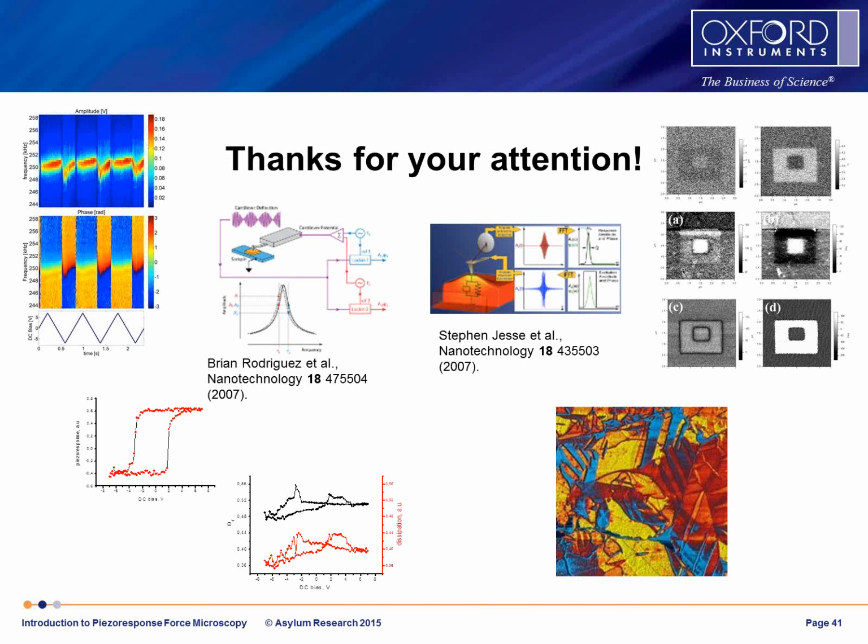In fact, there is a recent very detailed paper by Liam Collins and Brian Rodriguez about the electrochemical force microscopy, which explicitly discusses this issue. But practically it goes to the point that we can scan, for example, PZT ceramics at 100 kilohertz in reasonably concentrated solution, say 10 millimolar, and using 100-volt peak-to-peak oscillations, and we get a normal PFM picture.